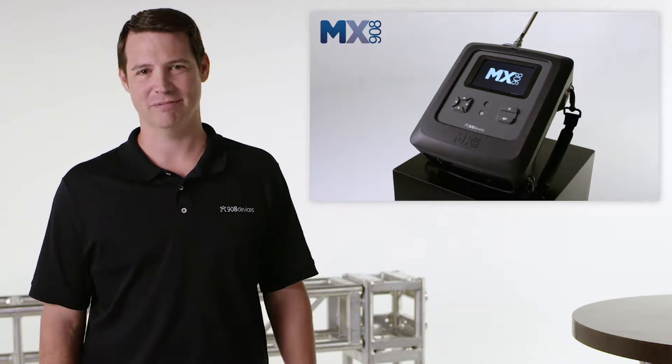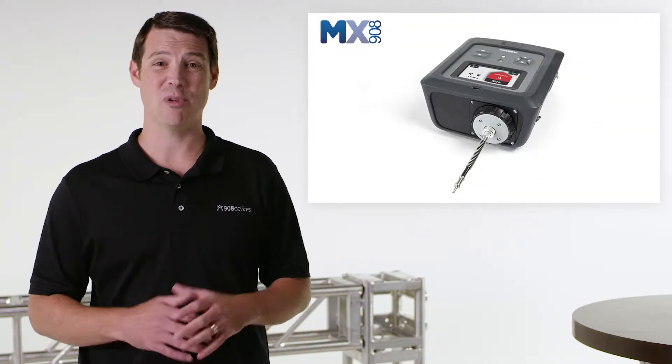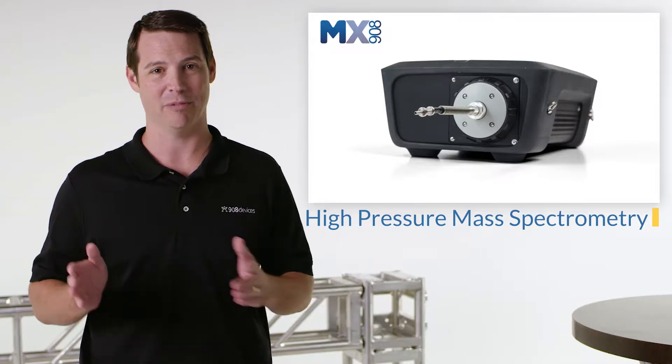This is MX908, our latest handheld mass spectrometer. It's the result of almost 20 years of research and development on our core technology, high-pressure mass spectrometry, or HPMS.